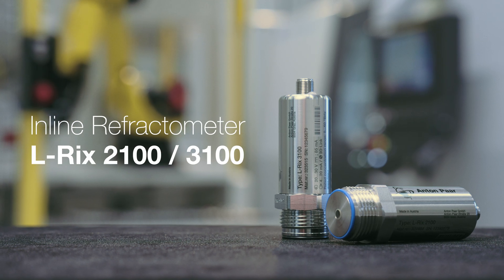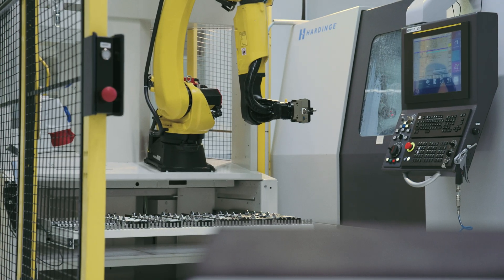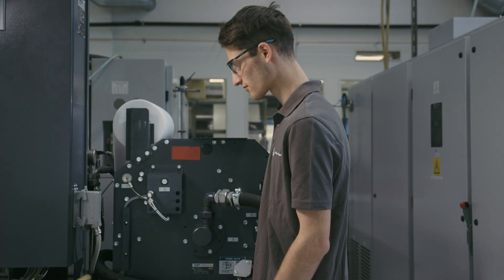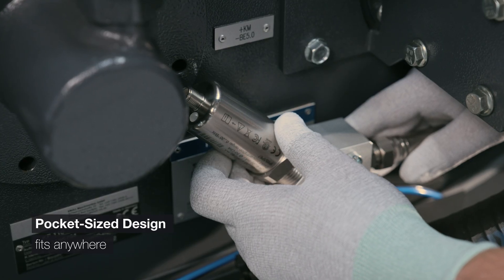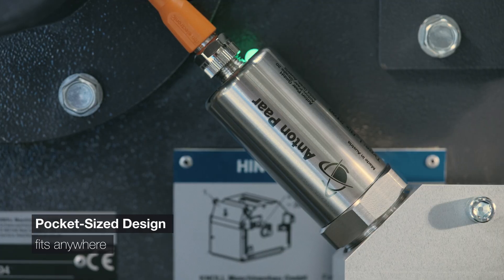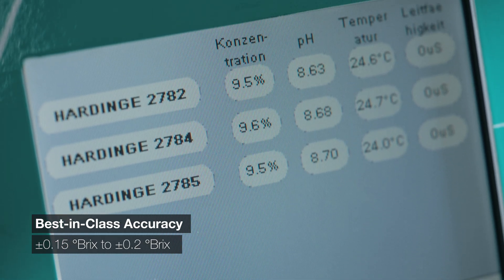Introducing the ELRICS 2100 and 3100 inline refractometers. The pocket-size design fits anywhere, making integration effortless. Unmatched accuracy at the best price.